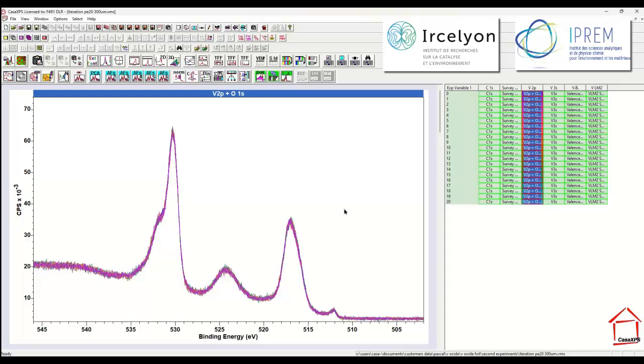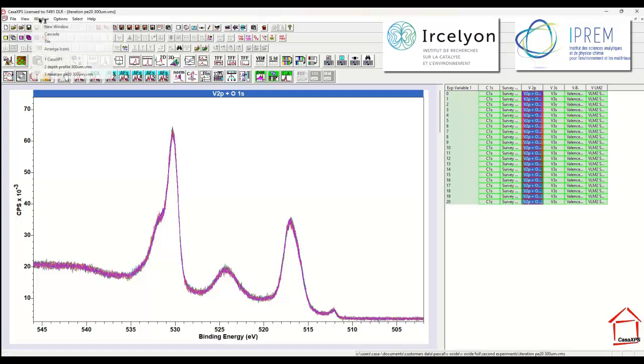In a previous video, I illustrated how PCA could be used to verify that data were in a state where we could sum the data without degrading the quality of the spectra. In this video, I'm going to look at a different data file.